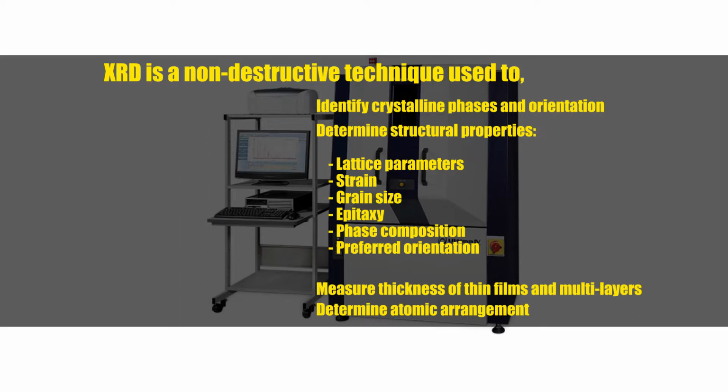Determine structural properties, such as lattice parameters, strain, grain size, epitaxy, phase composition, preferred orientation. Measure the thickness of thin films and multilayers and determine atomic arrangement.